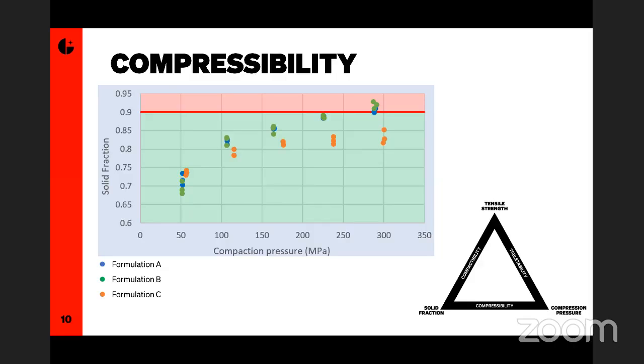The one exception I would say when it comes to comparing the same materials from different sources, where solid fraction does become useful, was an incident where I was comparing samples of a material from 2 different supplier sites, and I saw a significant difference in solid fraction. It turned out that one supplier was providing us with a different solid state form than the other, and that's the only time you should see a significant difference between materials that are the same, if there's an actual difference in solid state form. Otherwise, it only indicates a difference in composition.